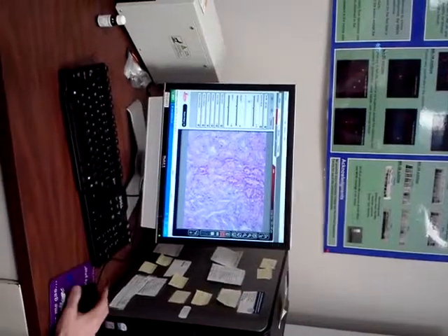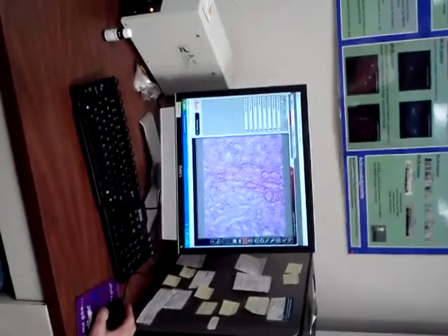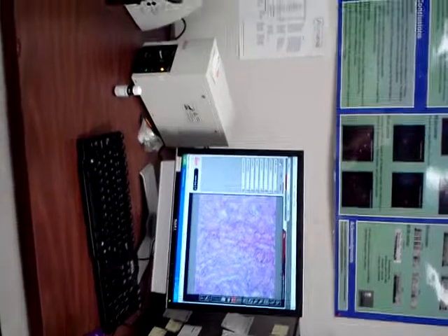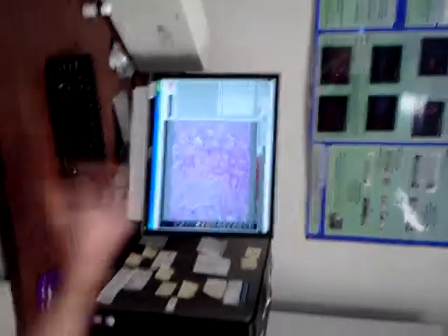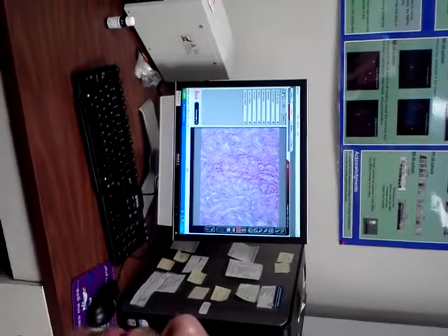See, and that's one thing that these guys haven't really had to do, is use exposure time. That's not something you've ever had to change. Okay. So we need to go over that. Sure. Okay, now because I was screwing around here, when you open up your program, did it immediately show what the computer's seeing right now? Yep. So this is like a live picture, basically.